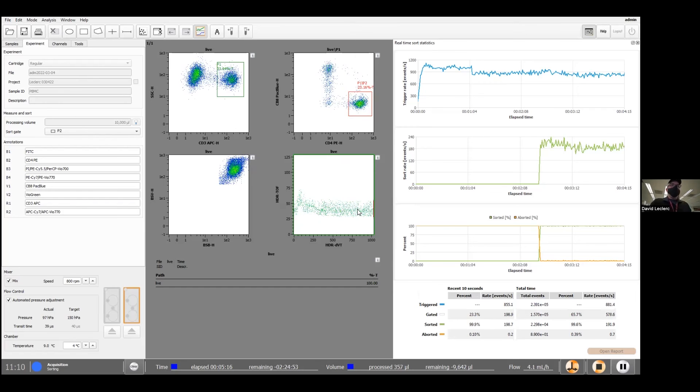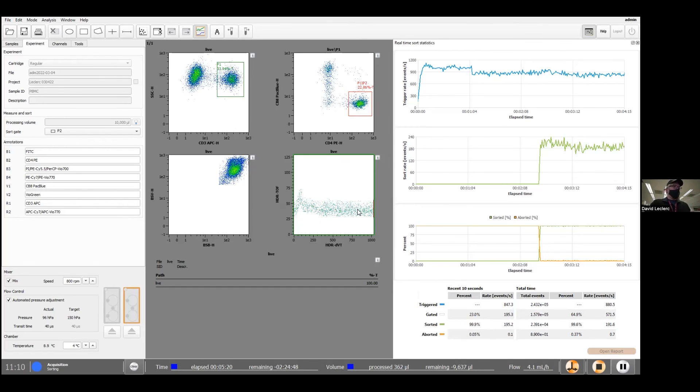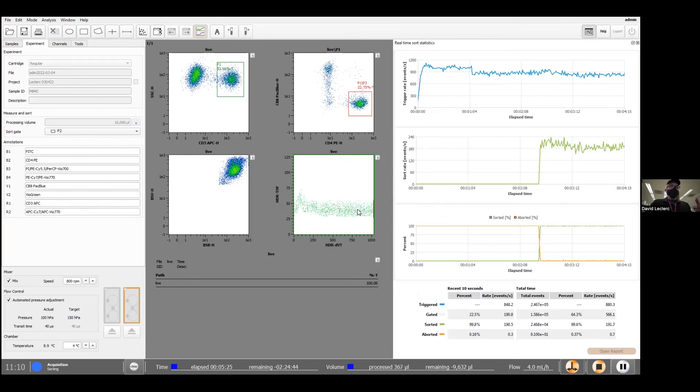If you have a flat line over here, that will essentially mean that the valve is stuck on your cartridge. There's a couple of things you can do to try to fix it. If that won't work, then you'll need to switch to a new cartridge.